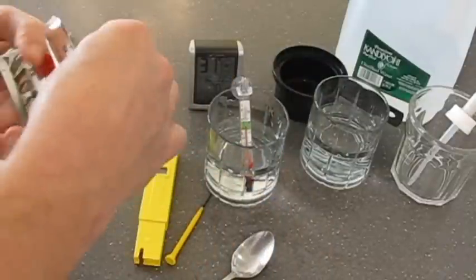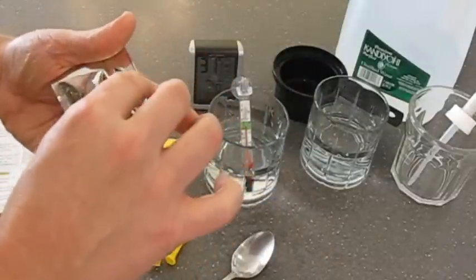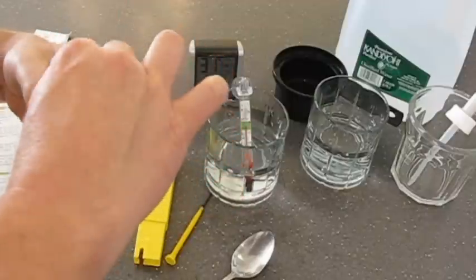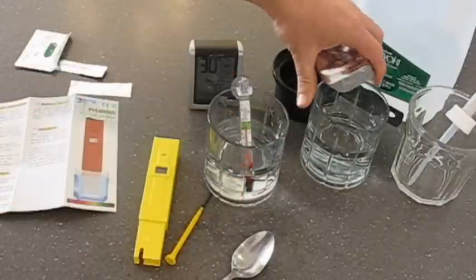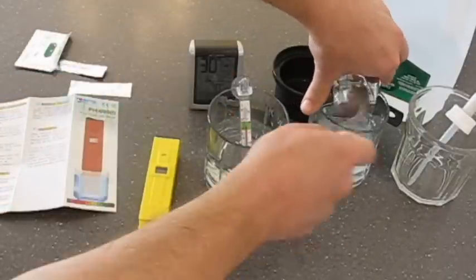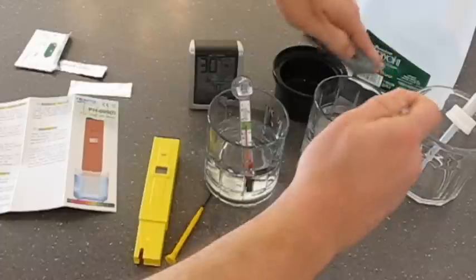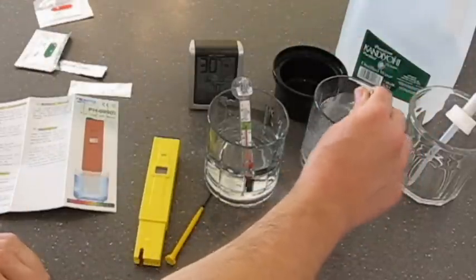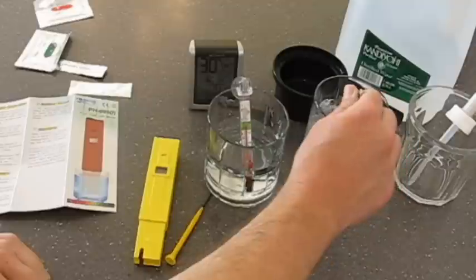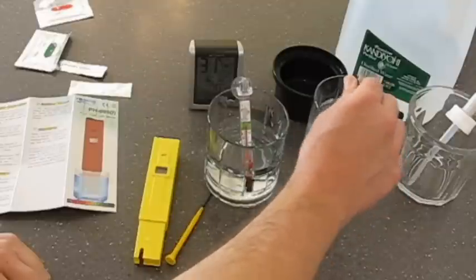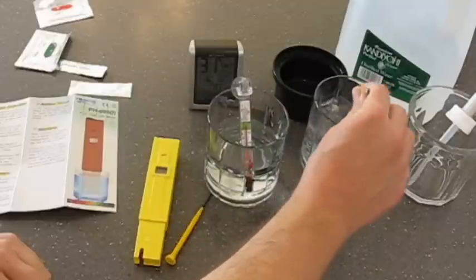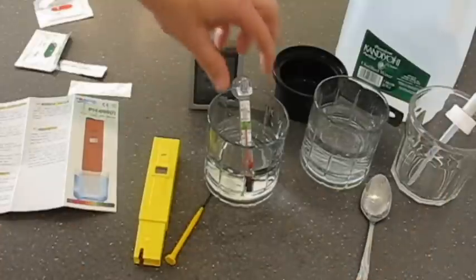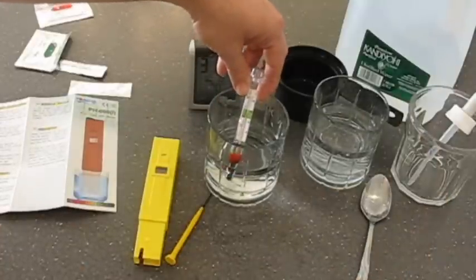So now I'm mixing the potassium hydrogen phthalate with my distilled water. Stir that up until it's completely mixed.